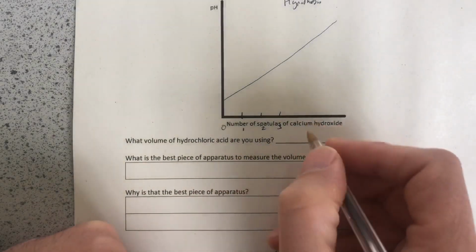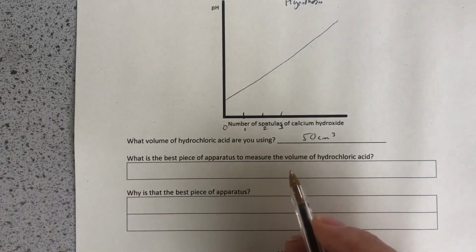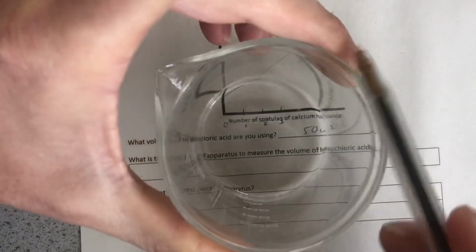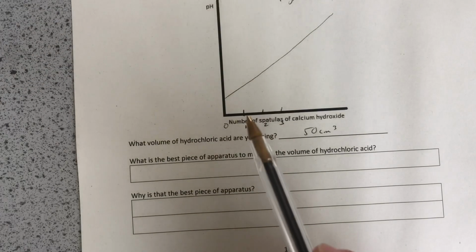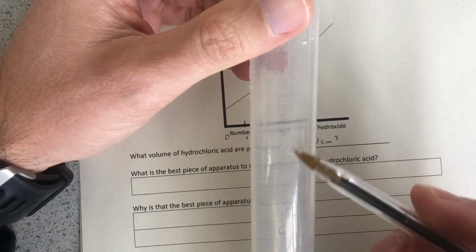What volume of hydrochloric acid are we using? Answer: 50 centimetre cubed. What's the best piece of apparatus to use to measure? Now, a lot of students would tell me straight away they're going to measure the hydrochloric acid using a beaker. Now, this is not a good piece of apparatus because they're very wide, so it takes quite a lot of acid to raise the height in the beaker. That means this is imprecise. A measuring cylinder is a much narrower piece of kit. So a tiny bit of acid will raise the height in the cylinder, so we can be more precise about our 50 centimetre cubed.